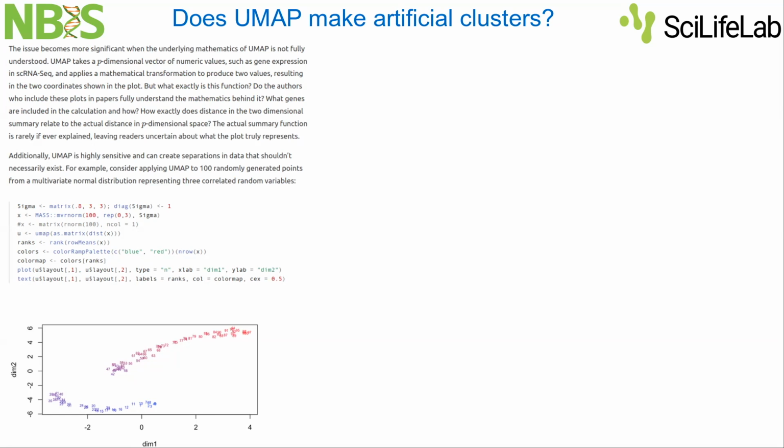You can think that all your cells are individual clusters, or all of them together are a single cluster. Those are two extreme situations, but sometimes you zoom in a little bit and you suddenly see some nuances in your data, some patterns. So it's a way to learn your data, to get familiar with your data, rather than giving you a perfect truth.